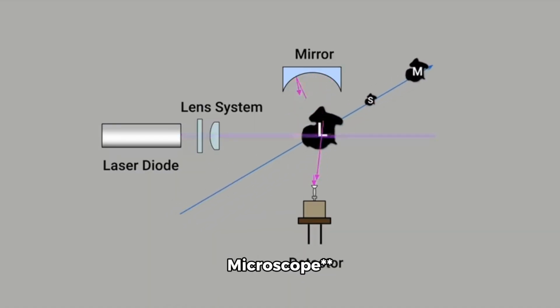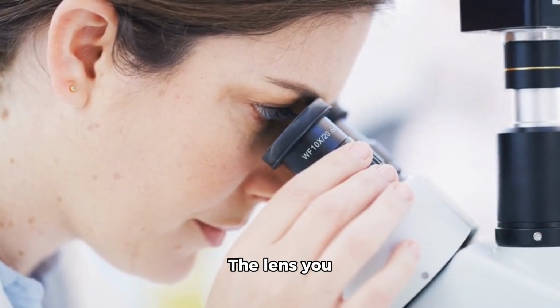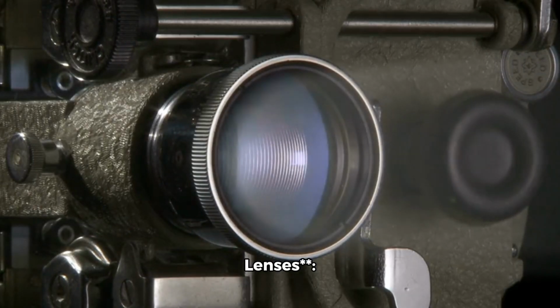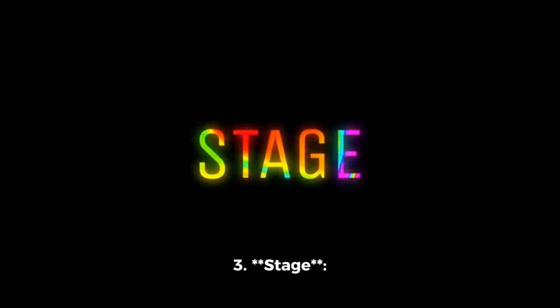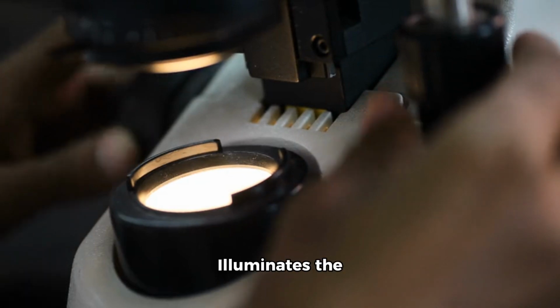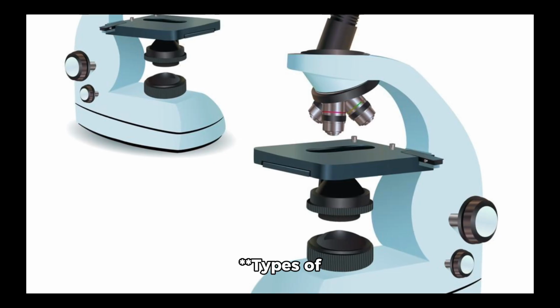Components of a light microscope. 1. Eyepiece (ocular lens), the lens you look through. 2. Objective lenses, multiple lenses with different magnifications, for example, 4x, 10x, 40x. 3. Stage, the platform where you place your slide. 4. Light source, illuminates the specimen. 5. Focus knobs, adjust to bring the specimen into clear view.